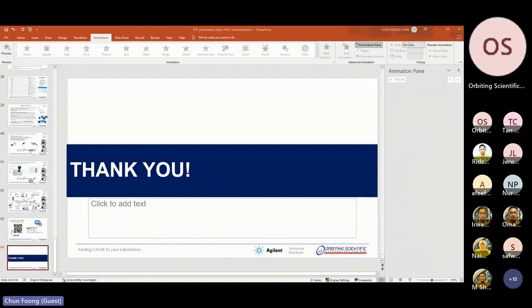The buffer can precipitate on the column, so it is a must to flush it. Every time you receive a new column, there will be a data sheet to guide you on how to maintain the column.